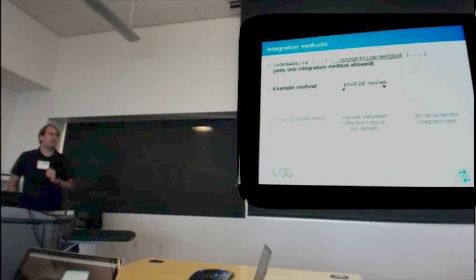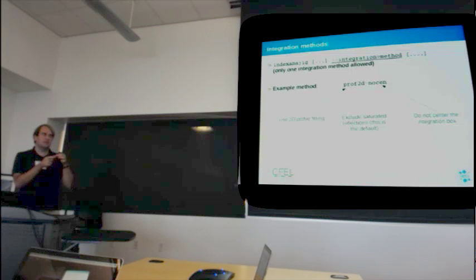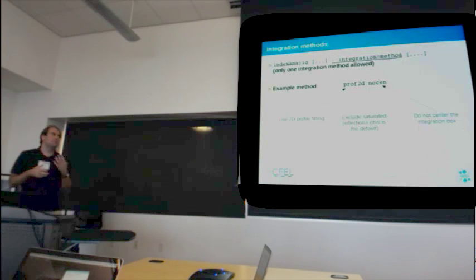We actually find often the basic ring subtraction integration works the best. This is because it's a bit more robust to poor geometry or maybe slightly dodgy predicted locations. The centering you have to be a little bit careful with, because that allows the algorithm to go looking for signal, and if there isn't signal, well, there's always a background, right? So if it uses only bright pixels to center the function, well, these still happen in a large data set reasonably often, and that can give you a bias in the data.